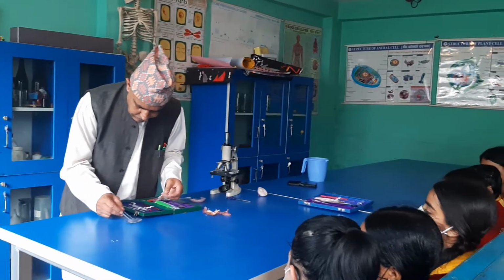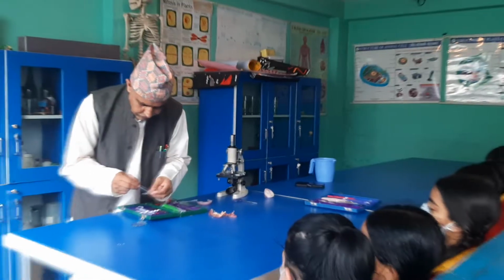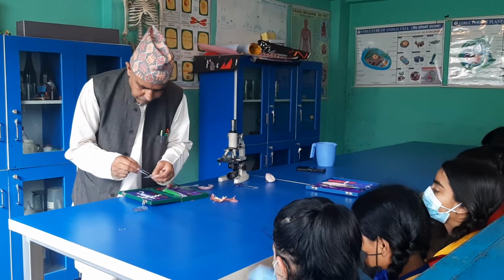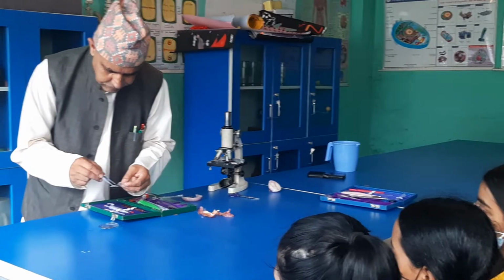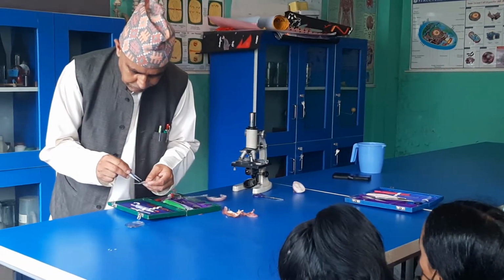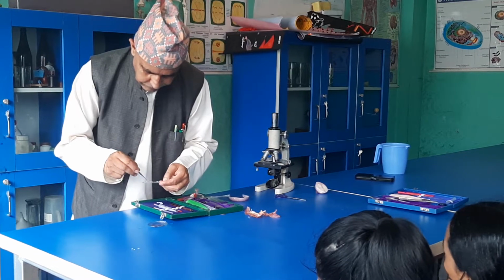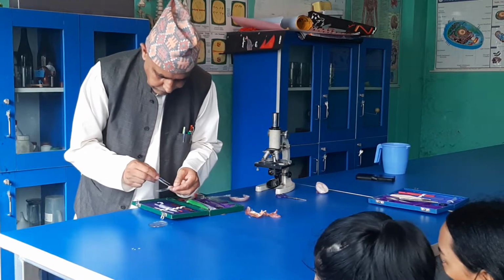Okay, so I am placing these different membranes. So what have I made here? Students, can you see? What have I made? Temporary slide, that's right. So temporary slide is very useful.